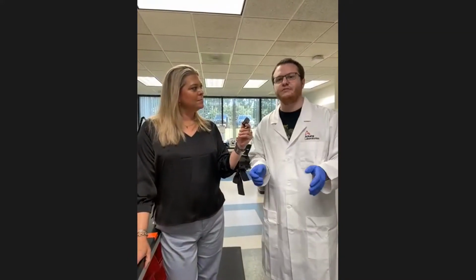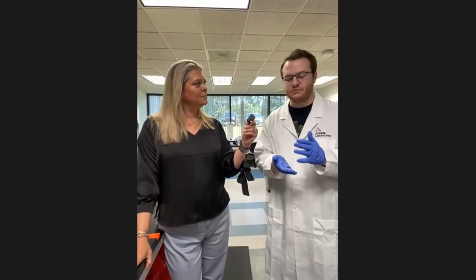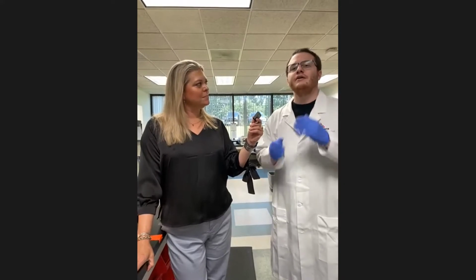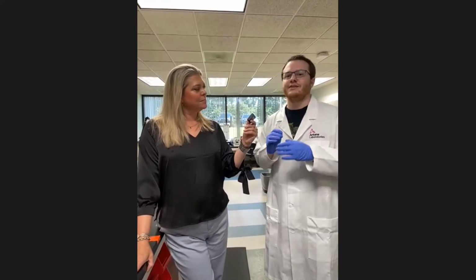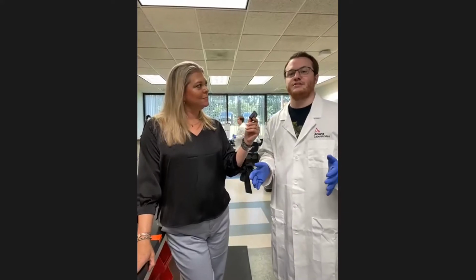They pull the tissue out, they measure it, they note those measurements on our internal paperwork, and the color and any pertinent information that they may notice. The formalin tissue goes to light. We take small samples from the formalin tissue for electron microscopy as well. And then the Michel's tissue goes to IF. And that is, in a nutshell, the accessioning and grossing process.